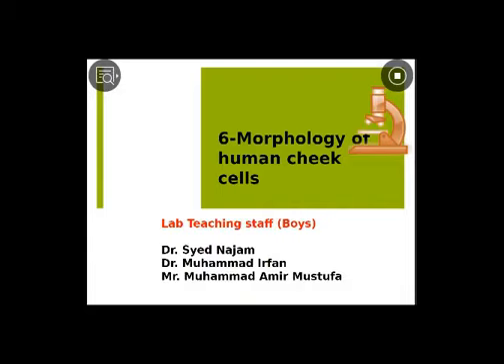Dear students, in the last experiment, I told you how to make a wet mount, yani aina bil moya. But in that experiment, we used the letter E, not the actual cell, only the letter E. Today in this experiment, we will use the original cell. The cell we take from our mouth, filfam, the cheek. Malum cheek? Cheek is the inner part of the mouth. So we take a specimen from the cheek and we make the slide.